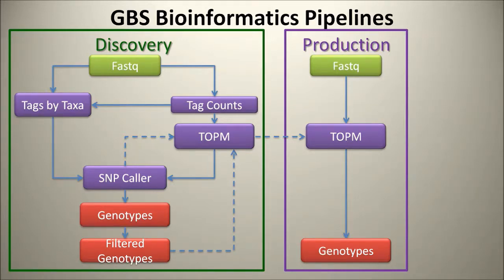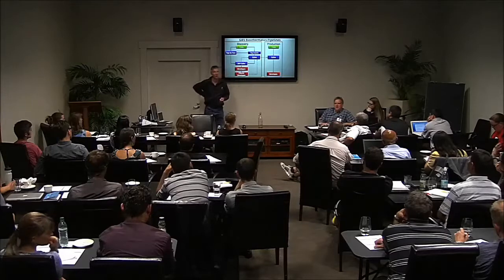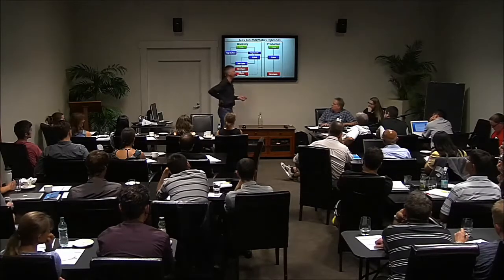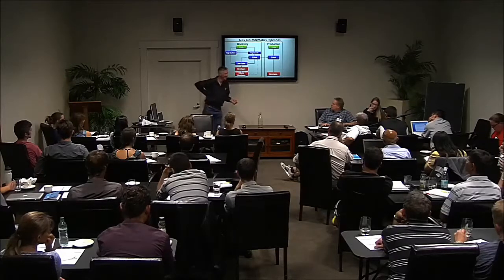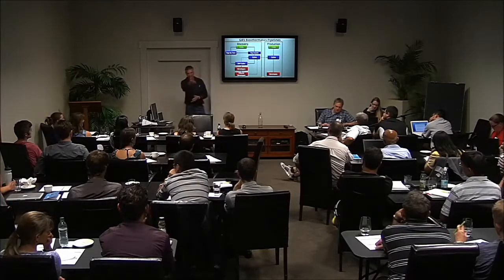I think we're a bit lacking there. We're missing that step. But yeah, we have some plugins, I think that Terry did, that you can use: once you've filtered out the genotypes, you give it the list of the ones you want to keep. So some of those things you filtered out would be paralogs or whatnot. You've got other information. Yeah, I know Terry wrote that plugin because I ran it. Right. I don't think I documented it though. But to answer your question, yeah.